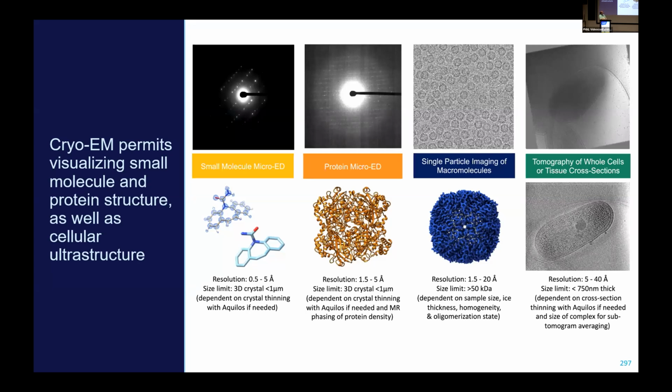In case we wind up working with a protein that has either as a precursor or a product a small molecule that has an unknown structure, or it's a new natural product and so forth, we have the ability to use small molecule microelectron diffraction to solve the structure of that small molecule or natural product and be able to identify the structure as well as chemistry that's ongoing when it interacts with the protein of interest.